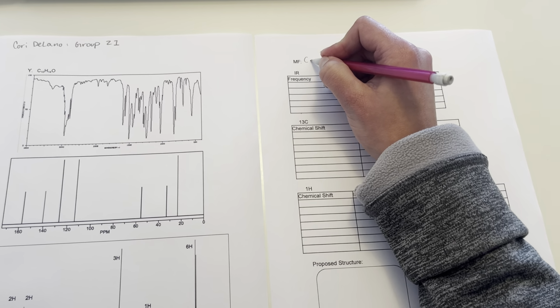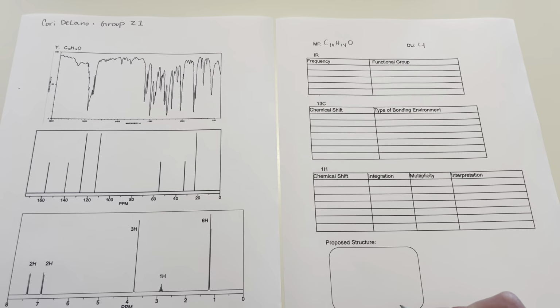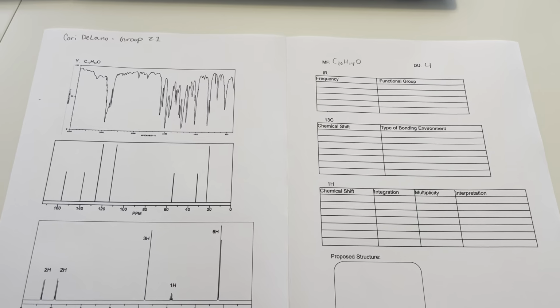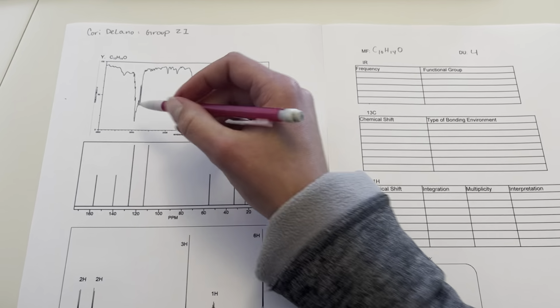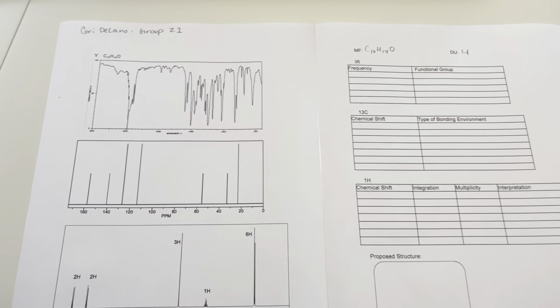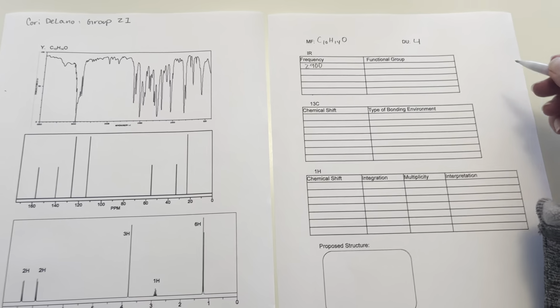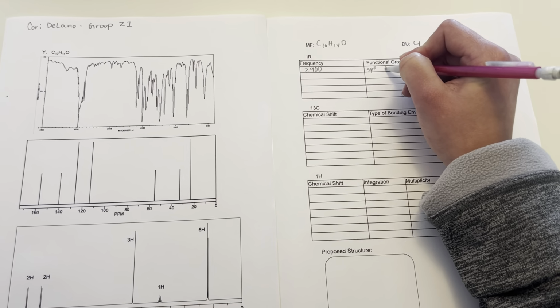Again, we have C10H14O. Now we want to move on to looking at our IR spectrum, and we want to look at the most important points here. This big drop down looks like it's below 3,000, so I'm going to say around 2,900, and that's going to be an sp3 CH.